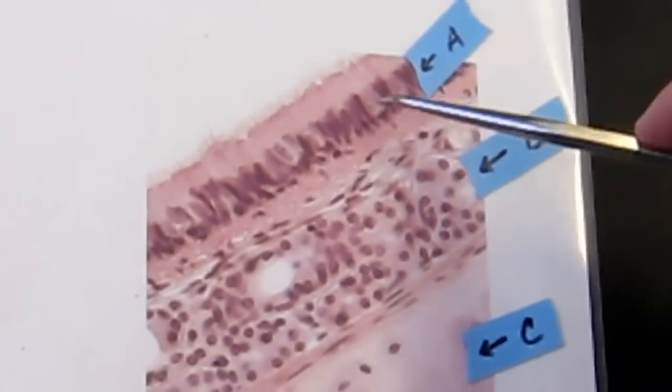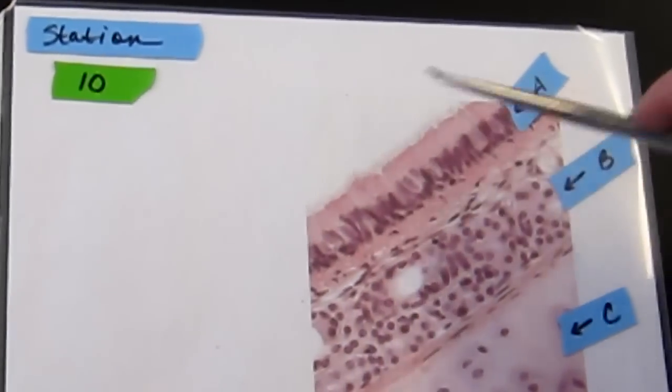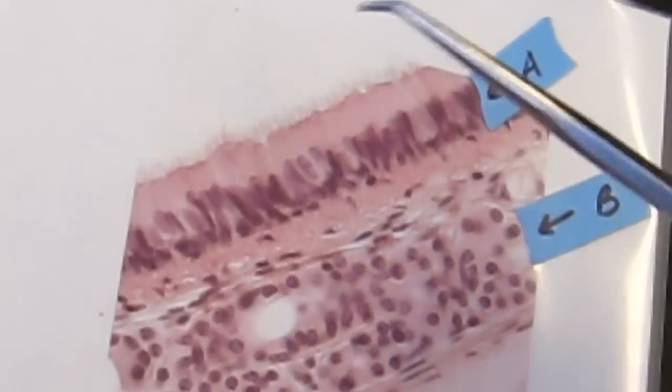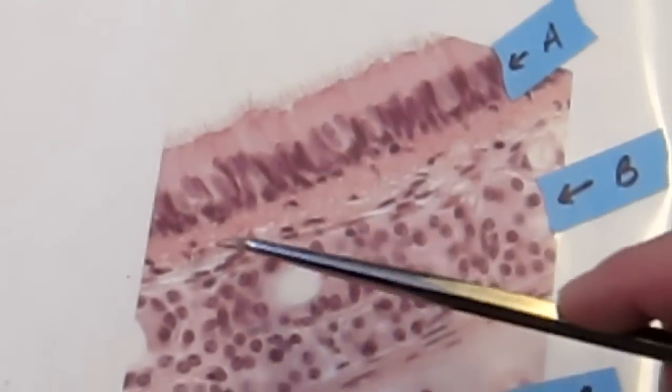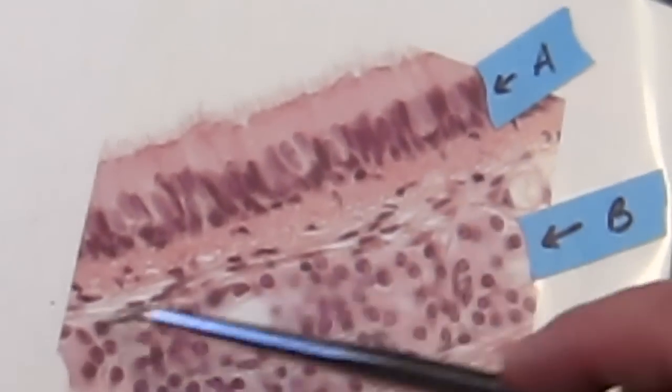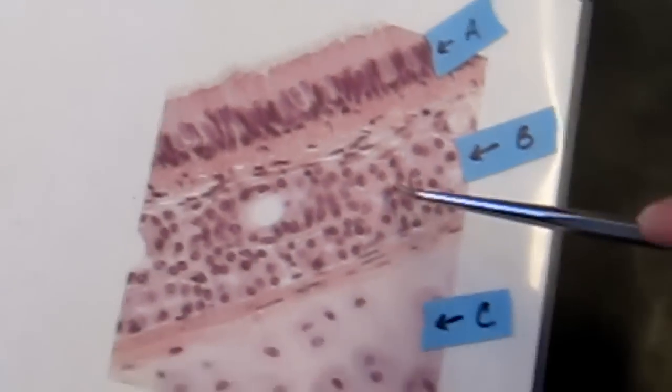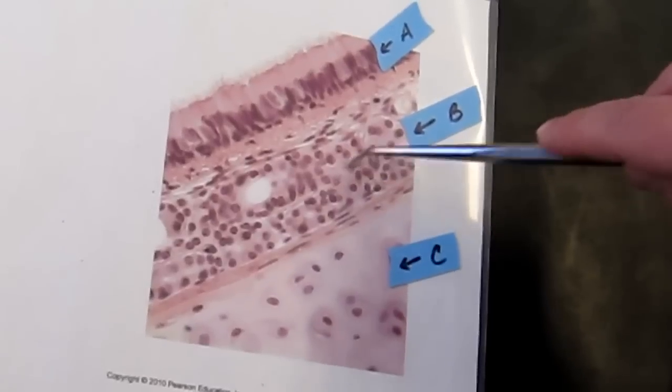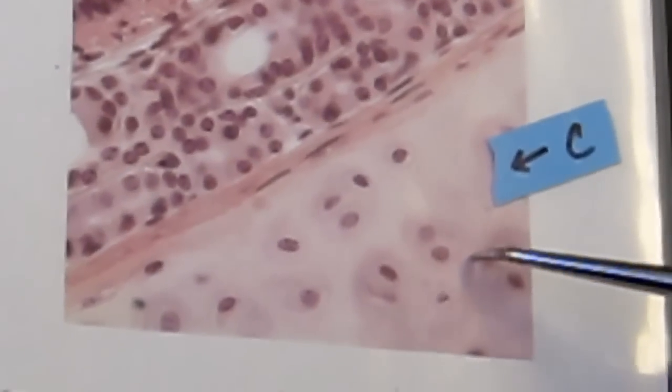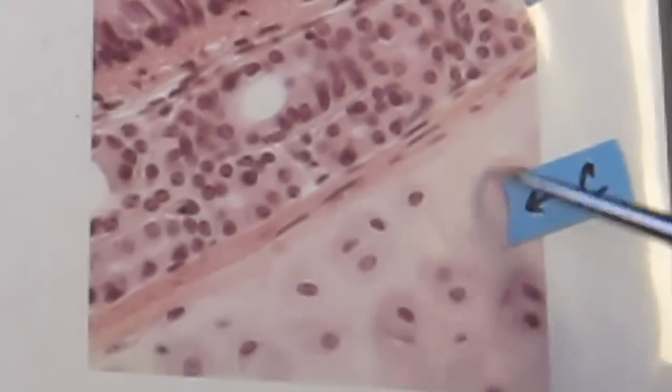And we want this epithelium here for the mucus production to catch solid material, little particles, as they're coming in, and the cilia is then going to move that dirty mucus away from the lungs so that any material that gets caught there doesn't get down in the lungs to disrupt gas exchange. We'll have a layer of lamina propria, which is the connective tissue associated with mucus membranes here, and then we get to the submucosa where you have loose connective tissue and these beautiful mucus producing glands. So that's again another mucus producer for cleaning and humidifying the air. And then the adventitia has this beautiful hyaline cartilage in it, and the hyaline cartilage is firm enough to keep an open lumen, but it's soft enough to allow us to have movements in the neck.